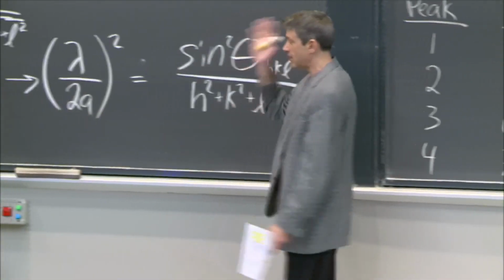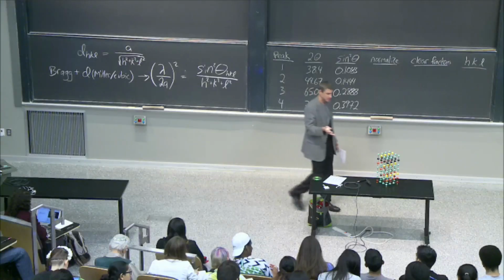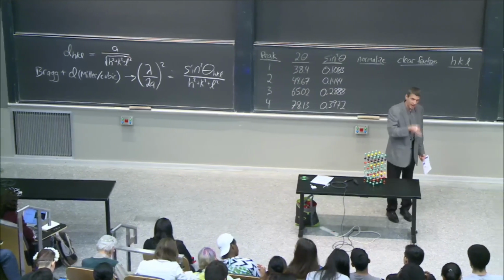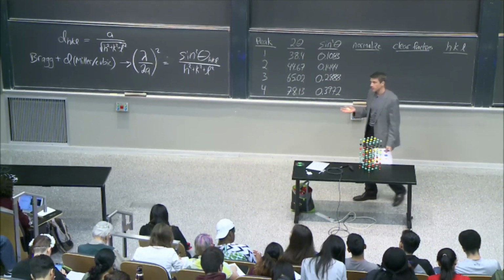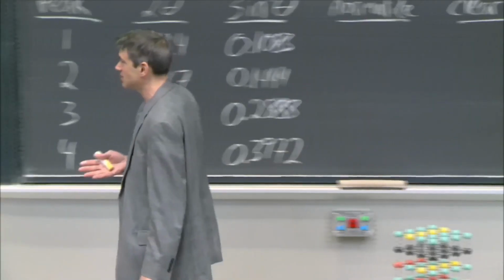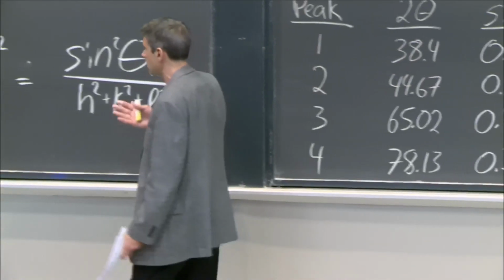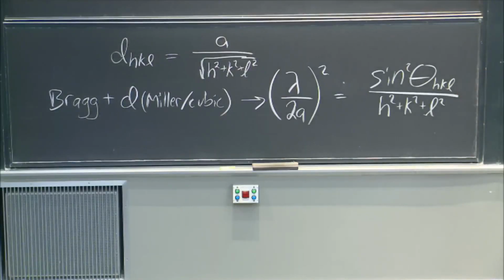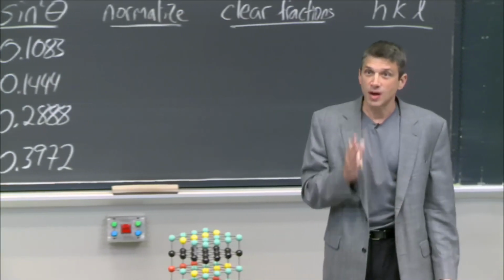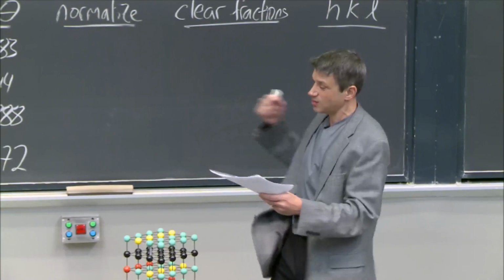And so we said, well, that's the whole beauty of these characteristic X-rays, because if you take a K alpha line from copper, it's always 1.54 angstroms. It's always lambda equals 1.54. That's what's so nice about it. It doesn't depend on anything else, just the metal you put in there as the target. And it's called a target because you're targeting it with electrons.